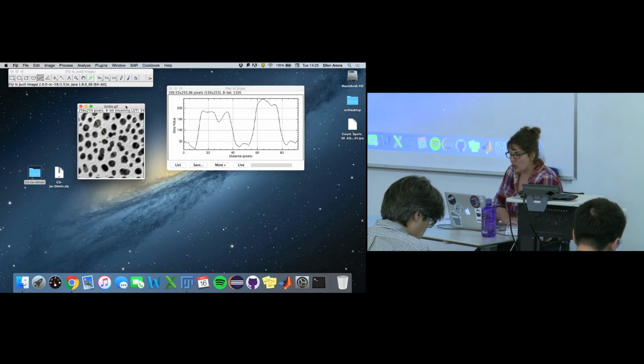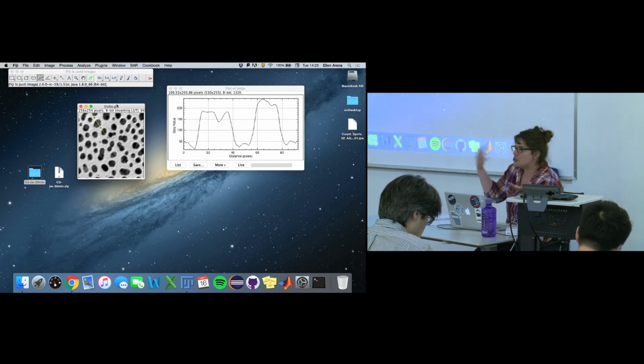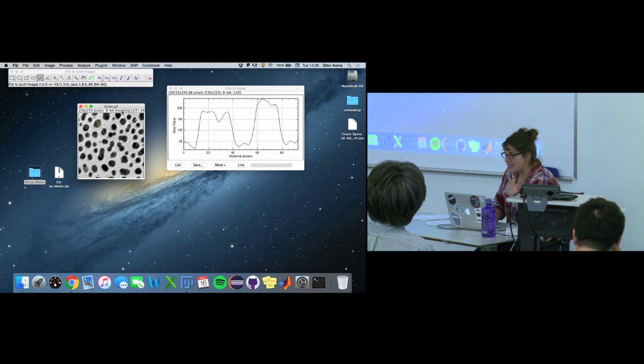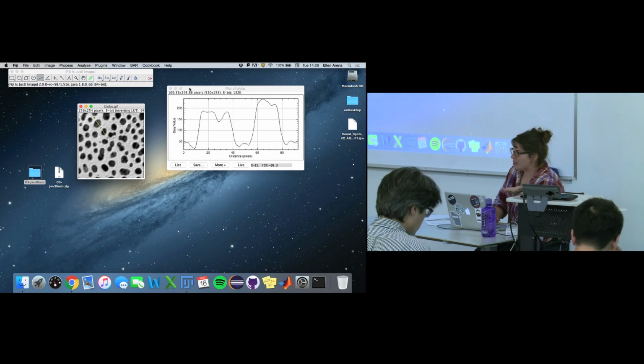If you look at the pixel values over the dark blob, we get pixel values that are relatively high, right? For us, a high value is usually white, and low values are usually dark. So it's showing us that this image is inverted, and it actually tells us at the top of the image that it's inverted. So it kind of cheated a little bit, but that's the thing. Just because the blob is dark doesn't mean the pixel values are low, in this case. It's not until you actually probe the pixel values that you can see that, all right?